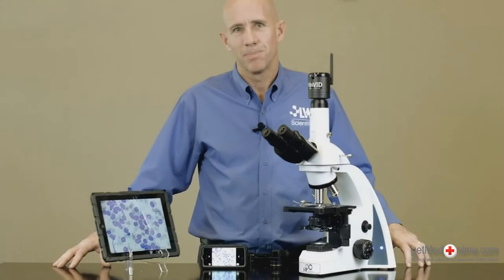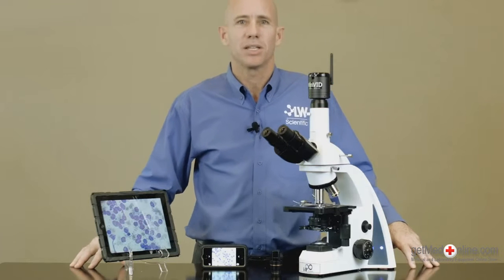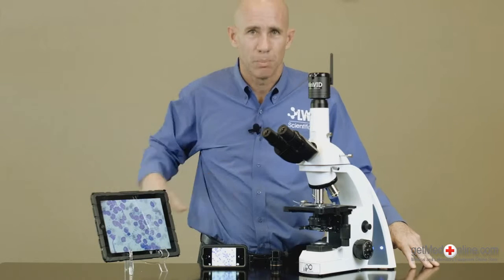Hi, I'm Mike Thomas. The Minivid Wi-Fi camera from Jorgensen Laboratories is an amazing addition to any brand of veterinary microscope. Take the microscope image to the client instead of taking the client to the microscope.